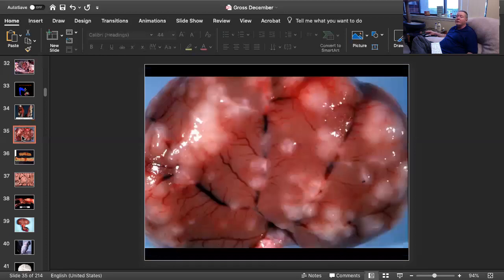Slide number 2 is tissue from a cat. Can you give me a morphologic diagnosis and a cause? Well, this is an absolutely fantastic picture of this entity. We are looking at the kidney of the cat. You can see the vessels on the outside of the kidney. Cat kidneys tend to be a little more tan-gold than other species and have this prominent arborization of vessels.